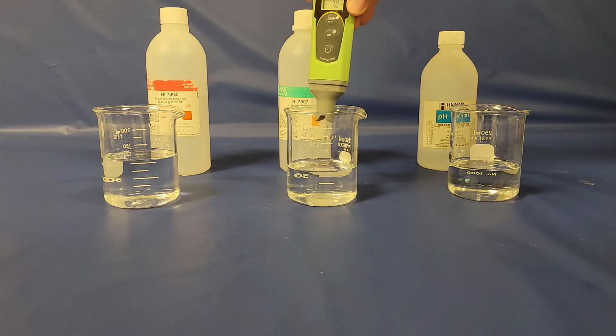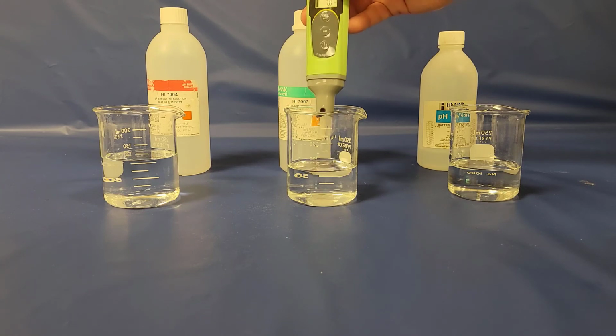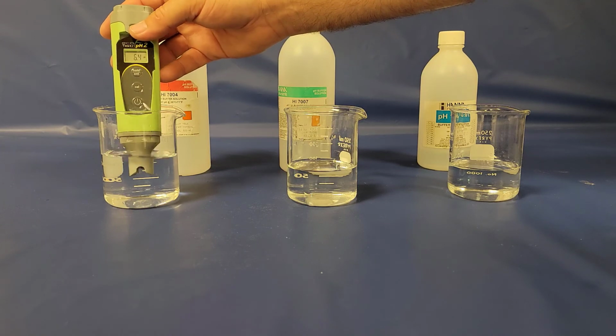And again, trying to get rid of the stuff here. You know, you can rinse these things off with deionized water in between, but probably not very many people do that. So here we go. I'm going to go over here now to the pH of 4.